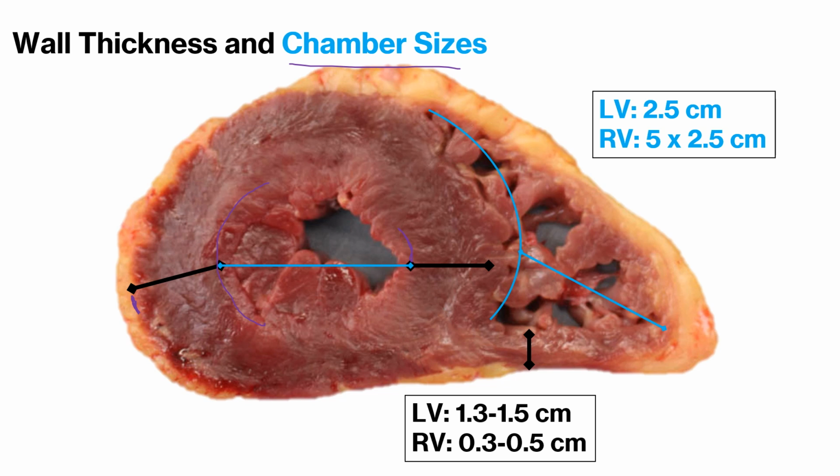So carrying that on, when we are doing wall thickness, again, for the septum, mid-septum, not including the trabeculae or the papillary muscles, so measuring from there to there. And for the right ventricle, I would always, always, always measure from the inferior posterior aspect. You can see the anterior aspect often gets fatty replaced, and this will be important for sectioning as well, but same concept, not including the trabeculae or the papillary muscles, getting the true wall thickness.